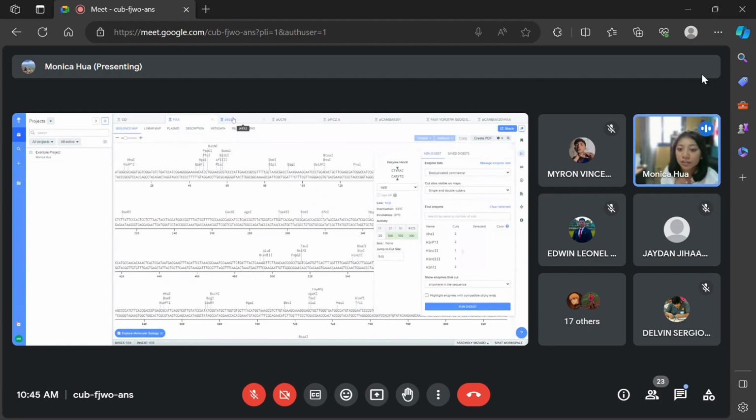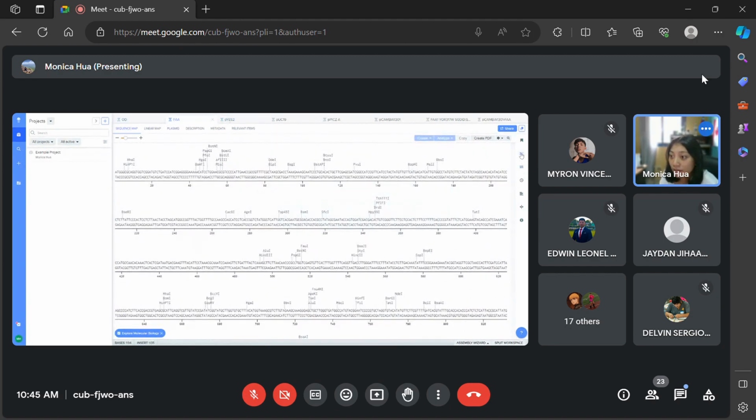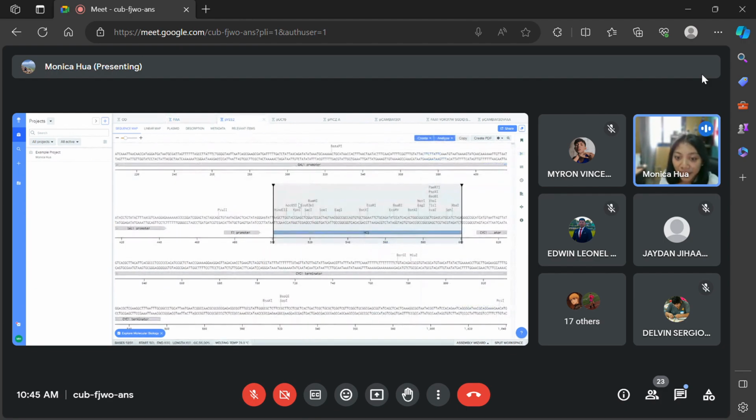All right, let's go again. Acc65I. Let me check if I have that. So you check again. Acc65I. Oh, I have one in my sequence, so I can't use it. Next. KpnI.